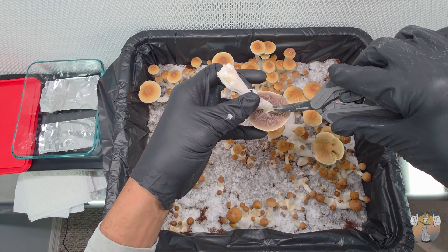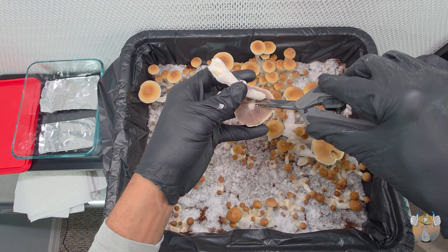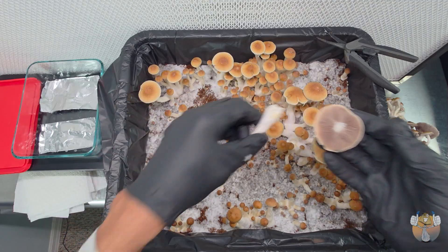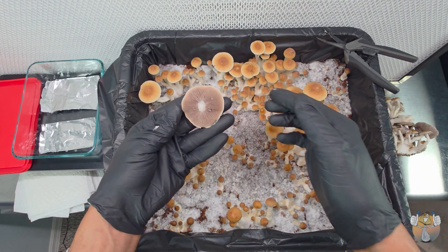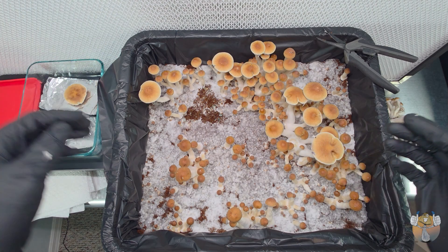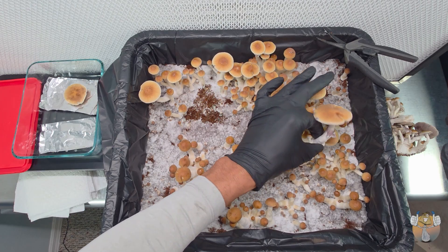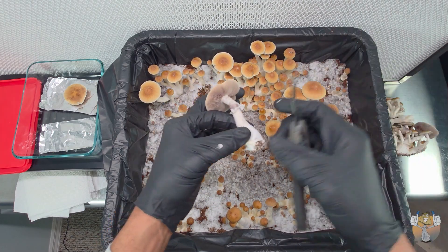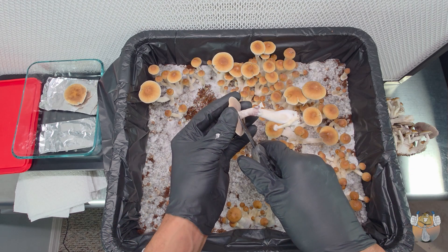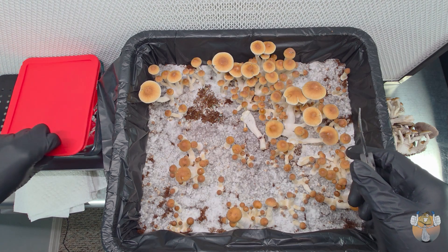We're going to use this cap right here for our spore print — it's a decent size and fully opened. We're going to place it face down on our clean foil and grab the next one, because these are the two biggest ones I'd like to create spore prints from. Again, face down on our foil, and I'm going to cover that for right now, but there are a couple more steps we're going to take.